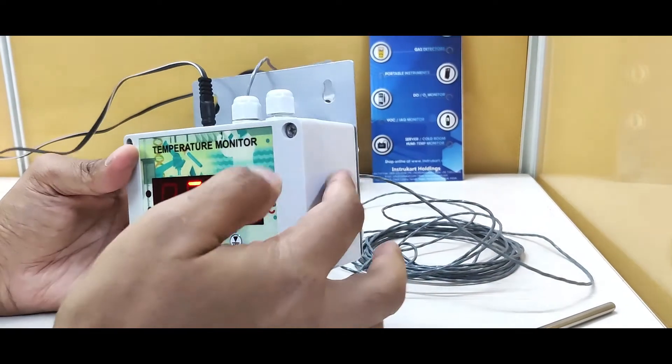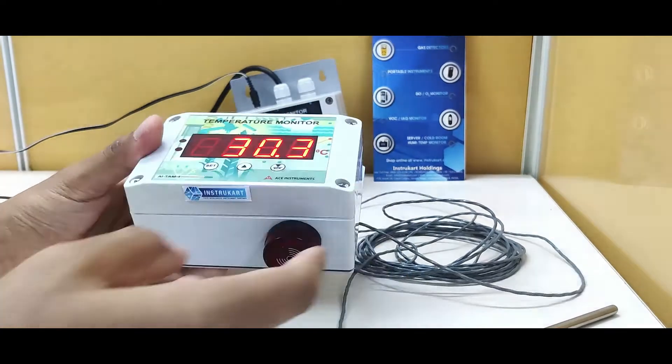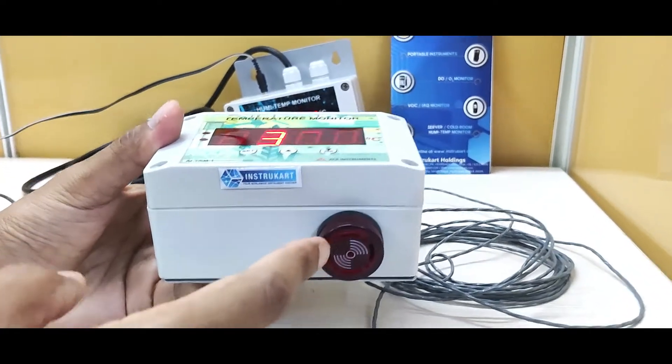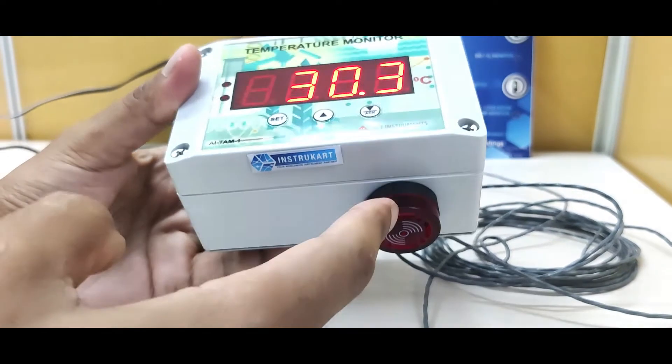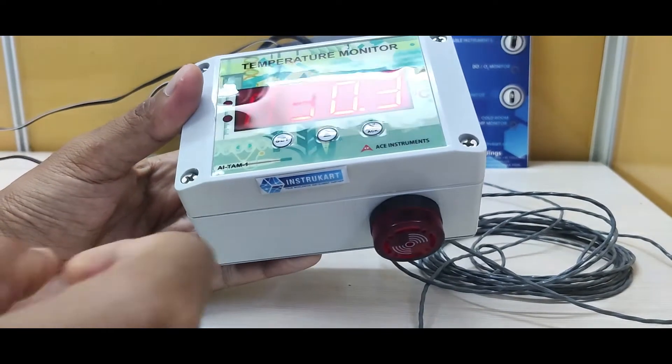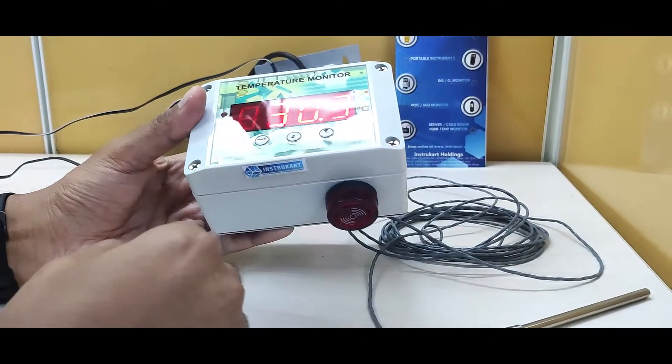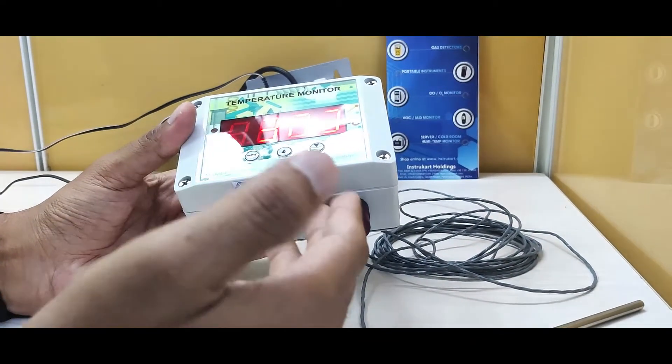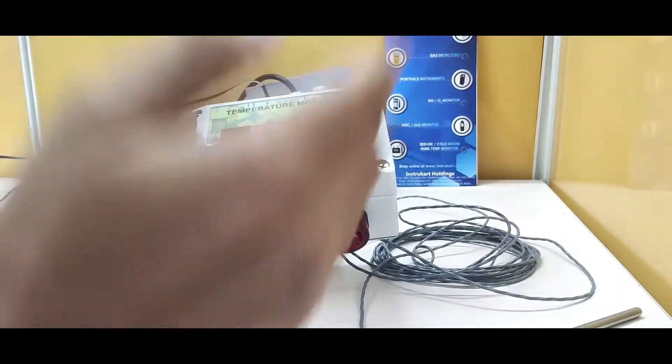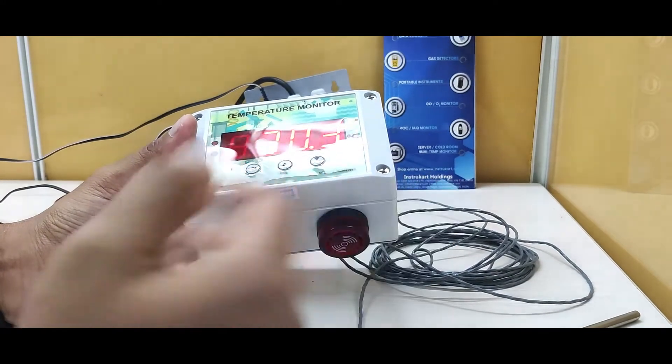The enclosure is ABS plastic. One of the best features of this device is the alarm shown here. This audio-visual buzzer can be extended by the user without intervention of any skilled engineer up to the security room or any surveillance room.